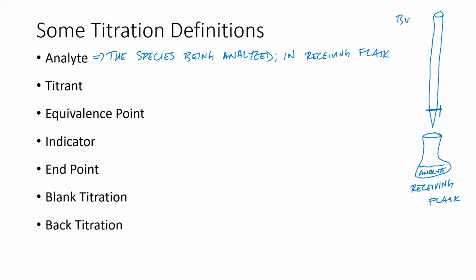This is the burette. And then, of course, this is our titrant. And so the titrant is whatever species is being dispensed, right?